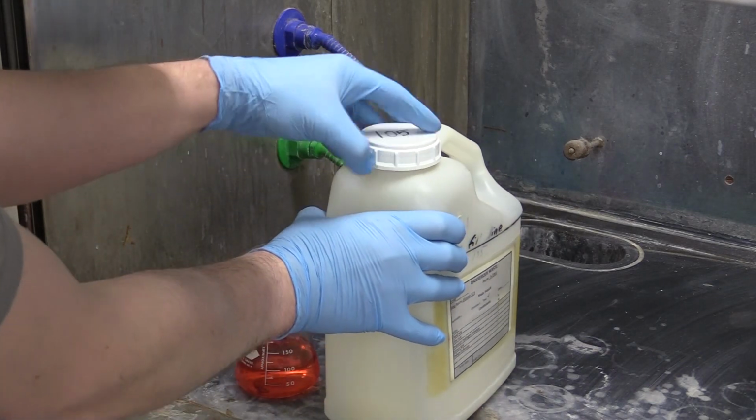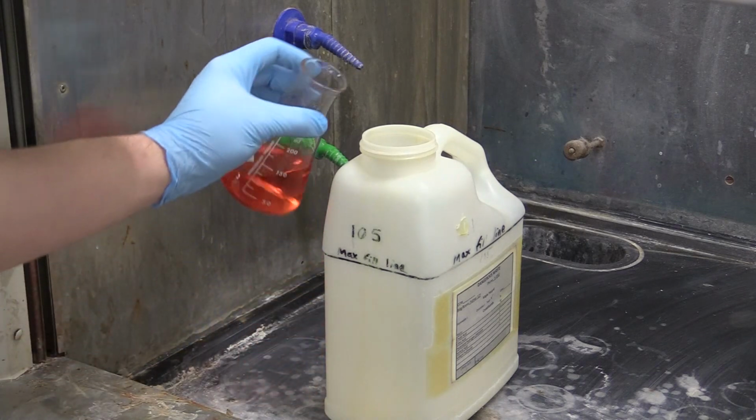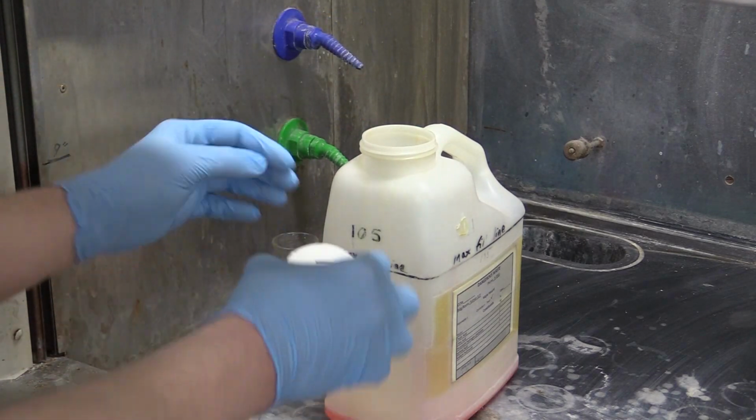As always, before you leave, make sure you dispose of all waste solutions in the proper container and clean up your glassware. For the Buret, rinse it several times with DI water and leave it with its valve open.